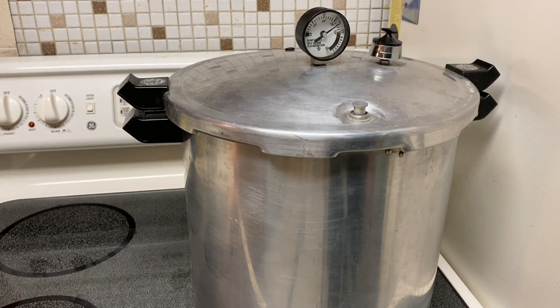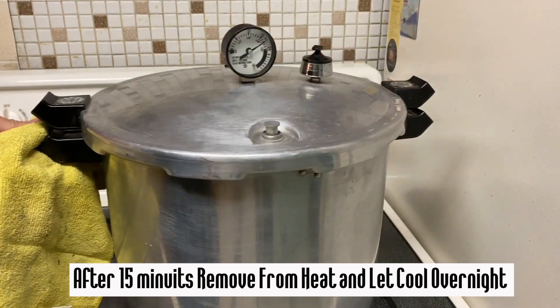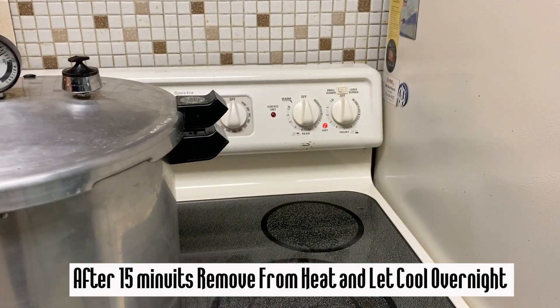Some pressure cookers don't have a psi meter on top — on old-school ones, when the metal piece on top is shaking back and forth you know you're at about that temperature, around 15 psi. You just want to keep that continually rocking back and forth for 15 minutes, then pull the pressure cooker off of the stove and let it cool down.